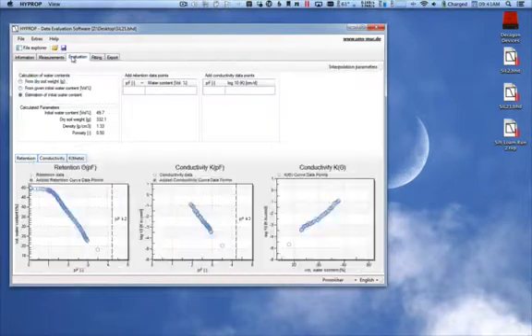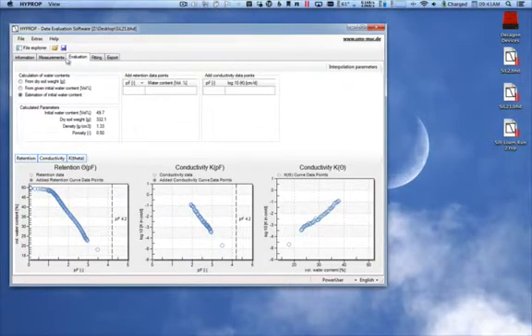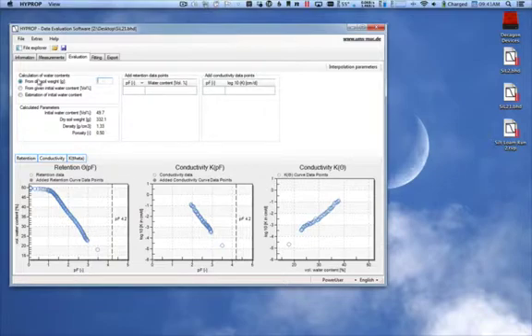We can now go to the Evaluation tab. Here, we can enter our dry soil weight to get an accurate measurement of volumetric water content and the soil bulk density.